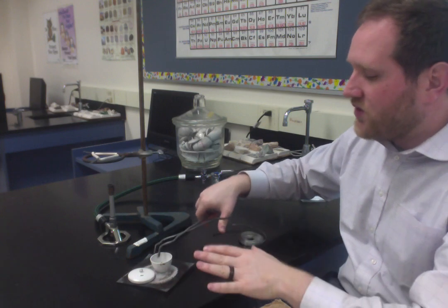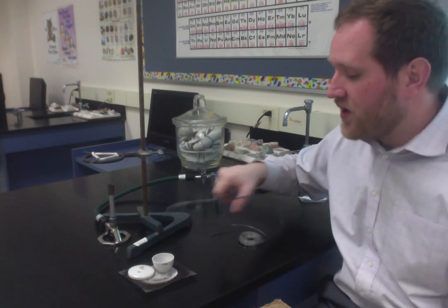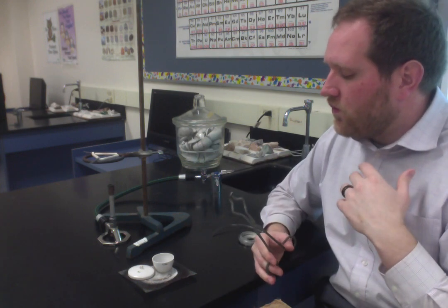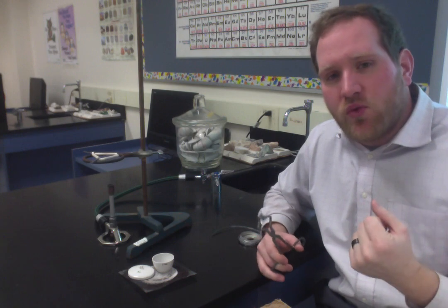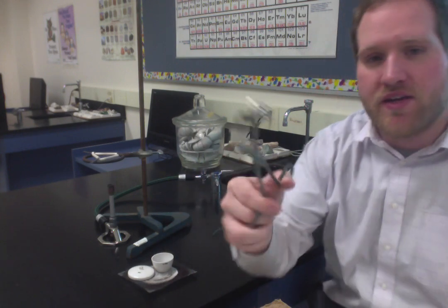And then once it's finally cool, you're going to put it on the balance and you're going to find the new mass. Now, what should the mass have done? Well, it should have gone up. Okay? So what we want to do is make sure that we're actually done. Because even though the outside of this should appear to be magnesium oxide, for all we know, maybe the inside of it didn't fully react. So we're going to burn it again.